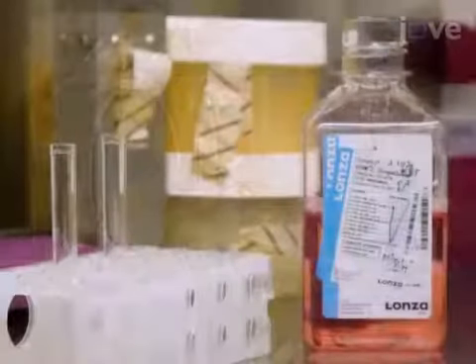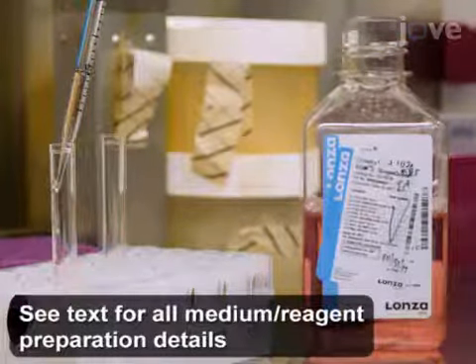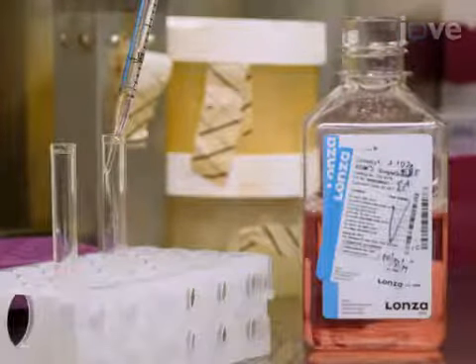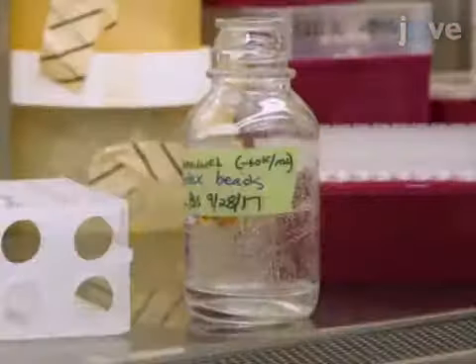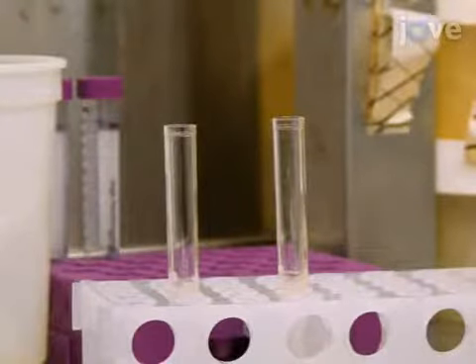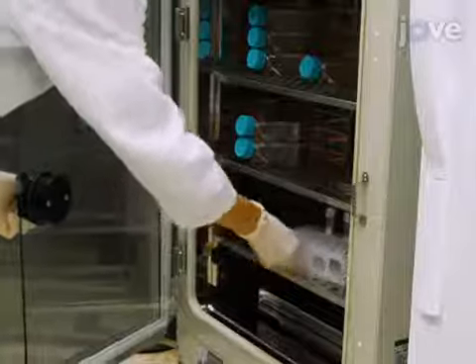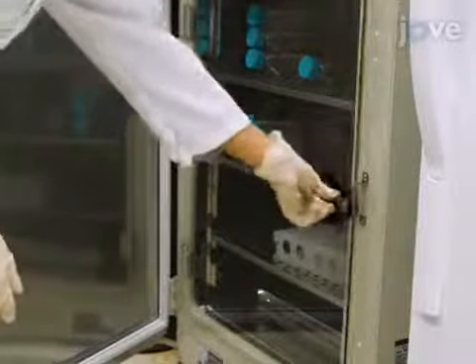Next, aliquot 1 milliliter of complete medium into the appropriate number of round-bottom fluorescence-activated cell sorting (FACS) tubes, and add 20 microliters of room-temperature-cooled autoclave sterilized microcarrier bead suspension to each tube. Add 1 milliliter of cells to each tube. Agitate tubes and incubate at 37 degrees Celsius for 2.5 to 3 hours with gentle agitation every 20 minutes.